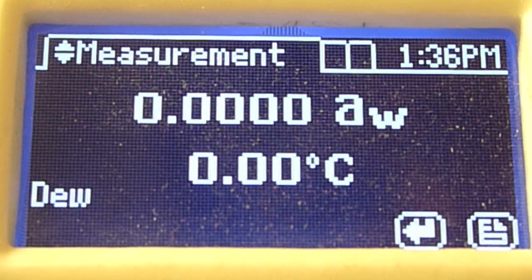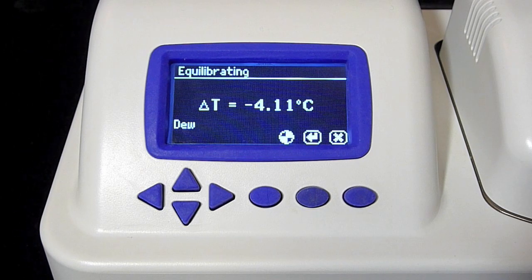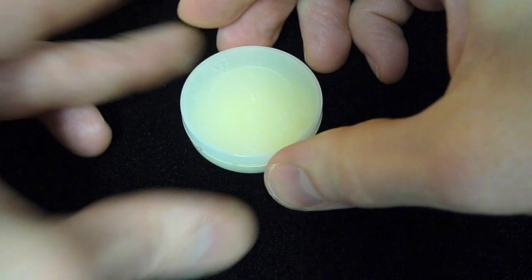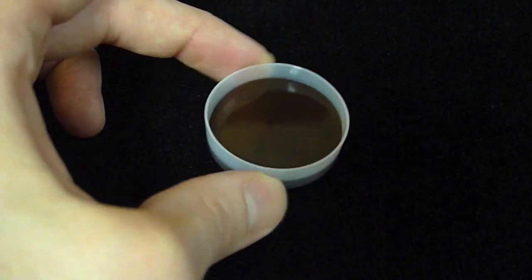Now let's return to the Series 4 that was taking the reading on the graham cracker. Once the read cycle is finished, the Series 4 will beep four times. Each time a reading is reached, the instrument automatically saves time, temperature, date, and user information. The whole process is pretty simple. Your job is to keep it fast — by making sure sample temperature is close to sensor temperature before you start — accurate, by protecting waiting samples with the lid, and clean, by preparing the sample carefully and filling the sample cup to just half full.